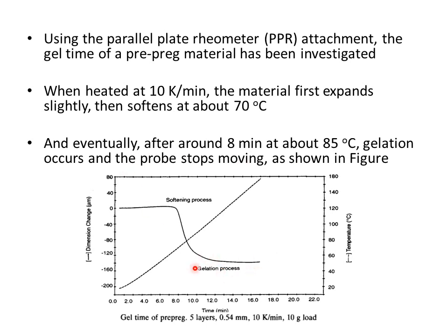Here the gelation process starts. In this time period, the probe oscillates quite freely, then the oscillation slows down, the gelation process starts, and the oscillation of the probe ultimately stops here.